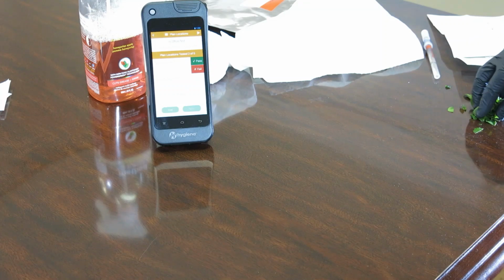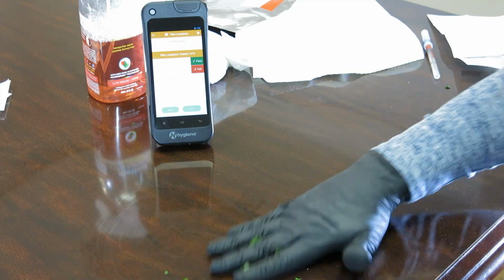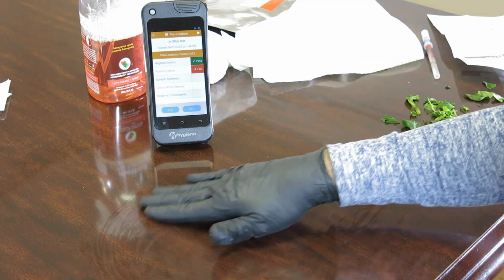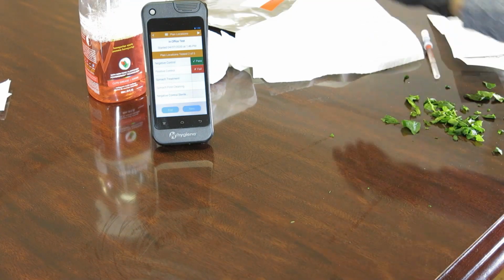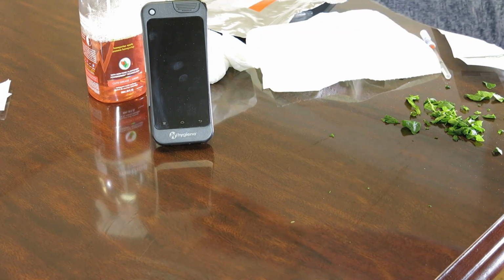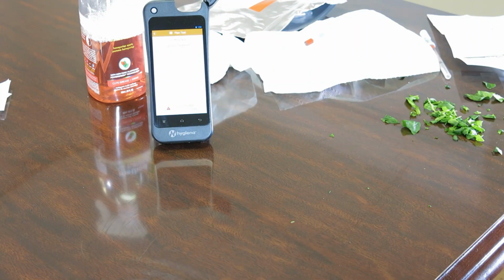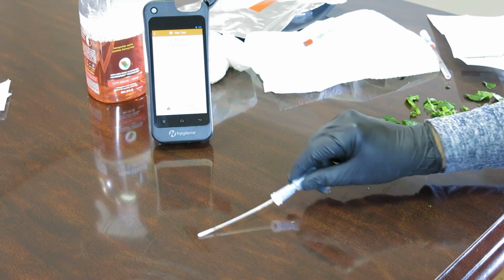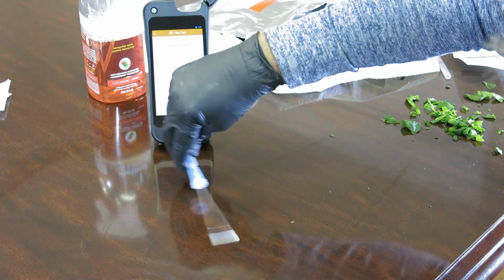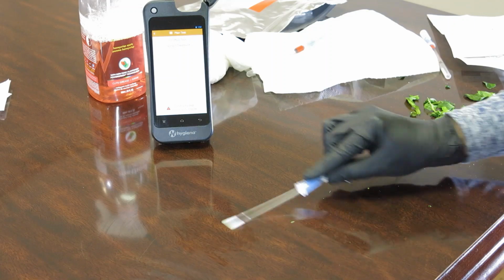Now I'm going to take some spinach and I'm going to kind of smear some spinach bits around on here. Popeye will tell you there's plenty of ATP in spinach. So now we're going to do the spinach treatment. And when you do this, make sure that you're turning the swab in so you pick up all the sides on it. This thing's going to go bonkers.